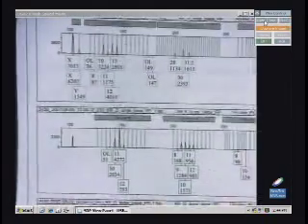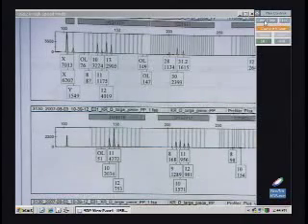Let me just see the next page. I haven't even looked at it. I guess the XY is pretty high. But actually, with a big, huge cutting like that, you probably would have seen everything off scale and tons of other artifacts. So that kind of keyed me into the fact that we are probably dealing with something downstream that's not quite working.